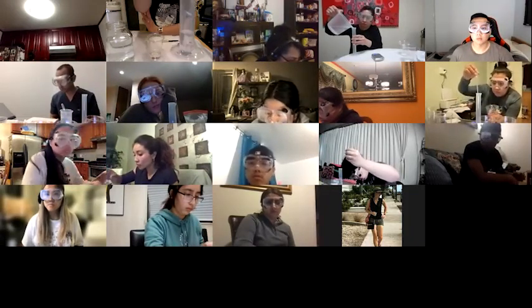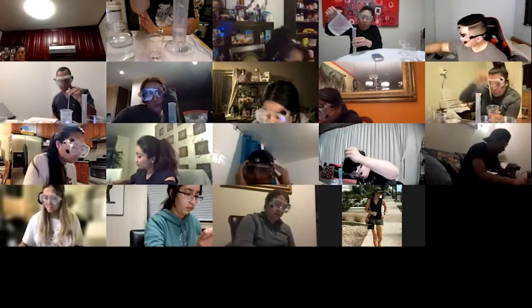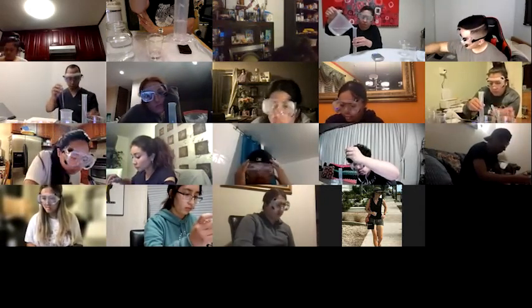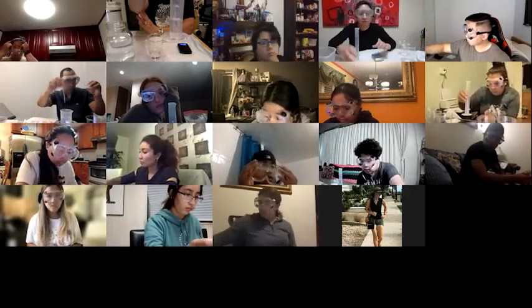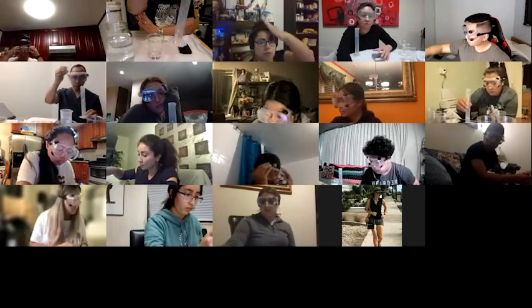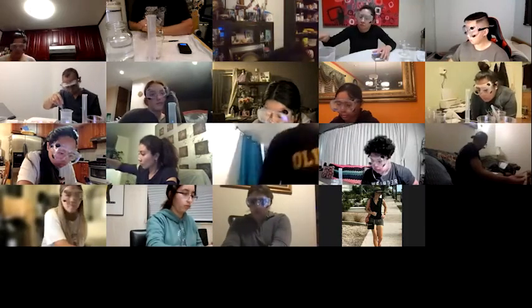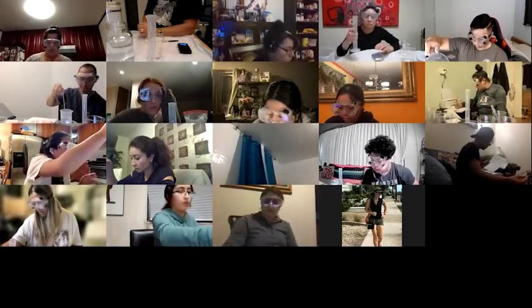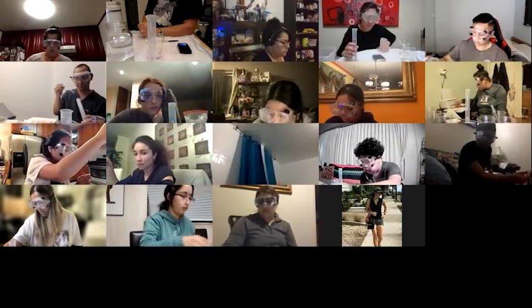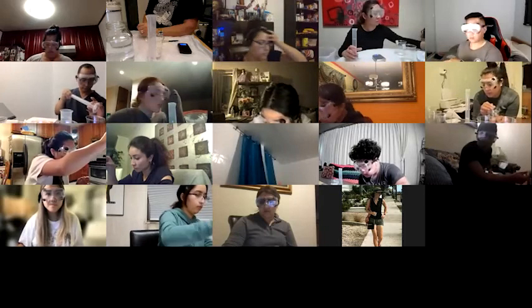And one thing I didn't mention is, as we start to get more and more volume, what's something that happens to water when you pour it in a cylinder like this? Is the line of the water going to be completely flat? No, the meniscus curves slightly. Sonia, if only I could see you, then I would be telling everyone what a genius you are. Yes, she's absolutely right. There's a meniscus. What does that mean? Could you explain what that is, Sonia?